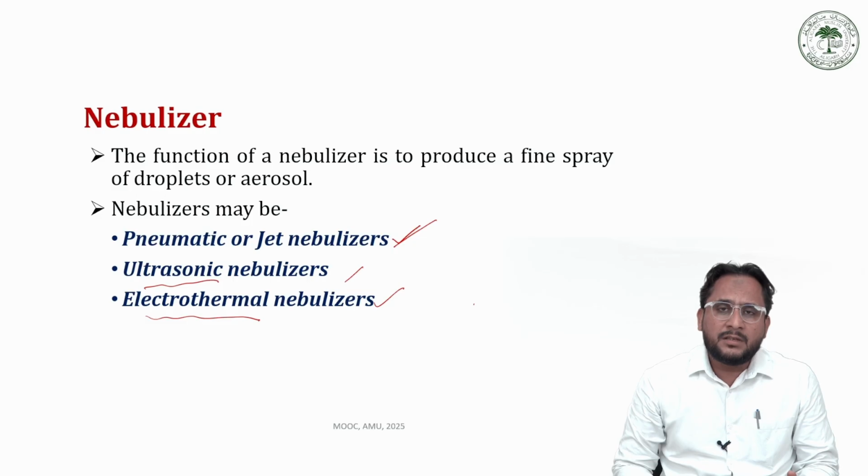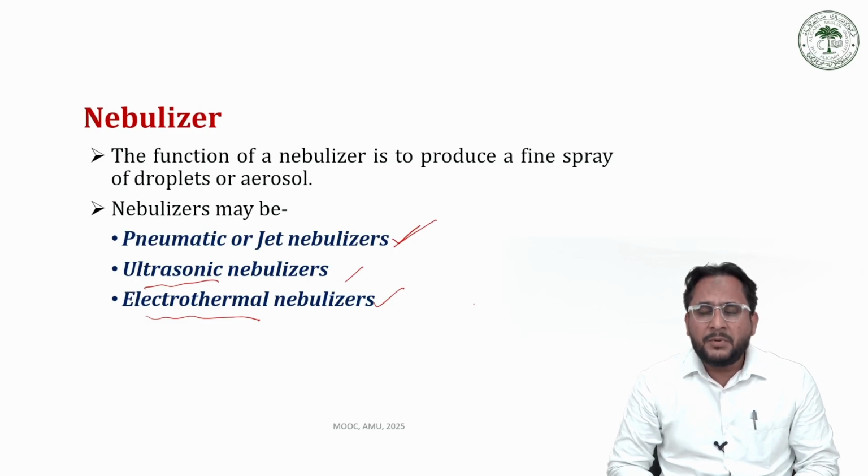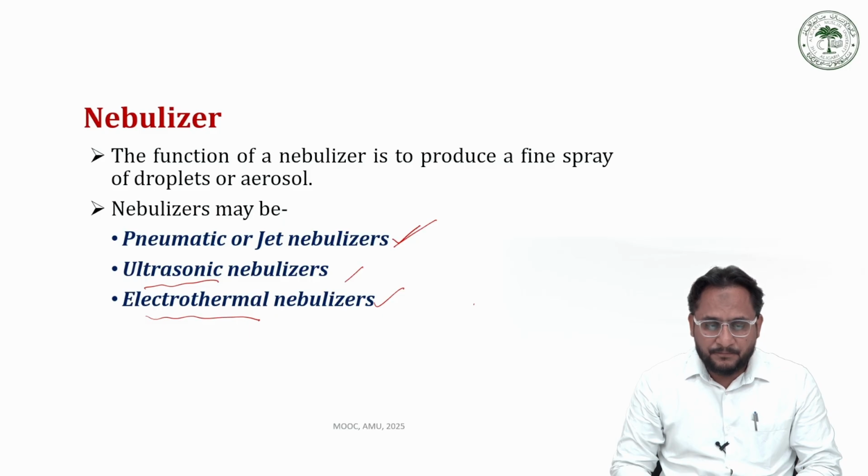Each nebulizer has its own merits and demerits depending upon the type of analysis, the facilities available, as well as the capital cost available in the industry or the research institution. We may select different types of nebulizers.